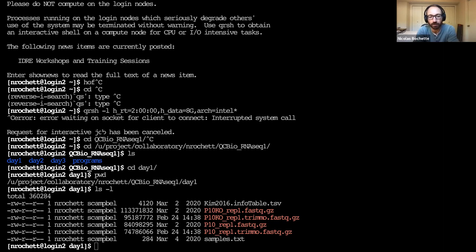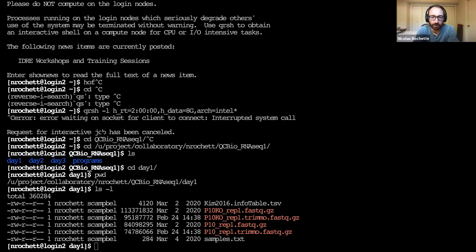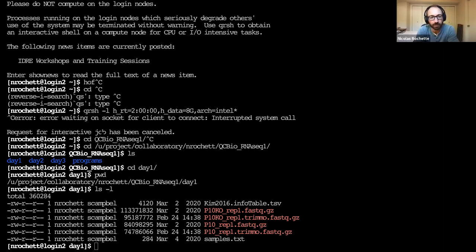So that makes sense. For one given experiment, one given analysis, you really just have to do this upfront. Once you've picked your reference genome, you do this upfront, and then it can stay stored as the STAR database for the remainder of your experiment. Yeah, it really is just a rewrite of the genome. Got it. So it's just an image, from a specific angle, of those FASTA and GTF files.